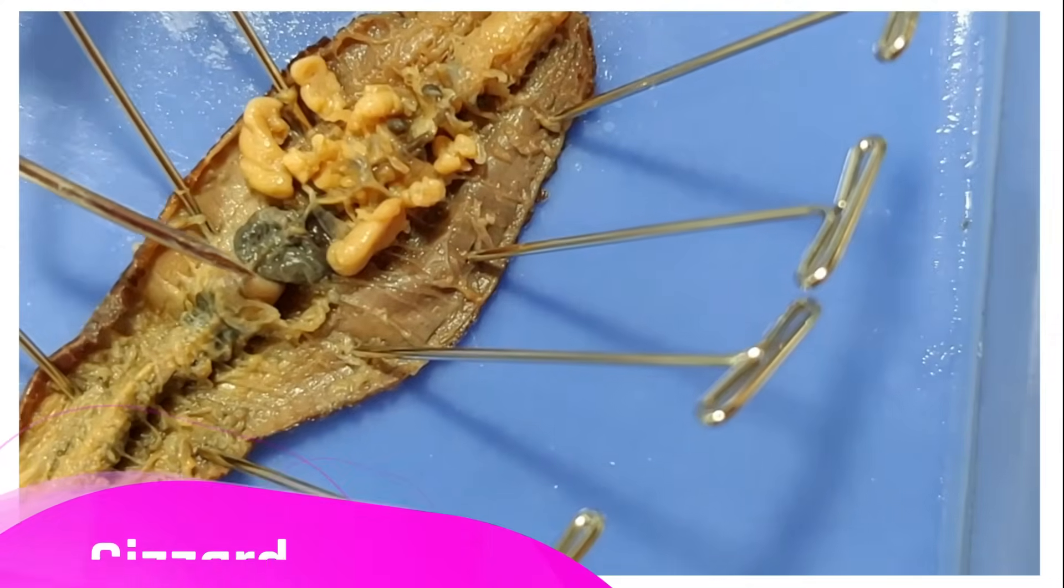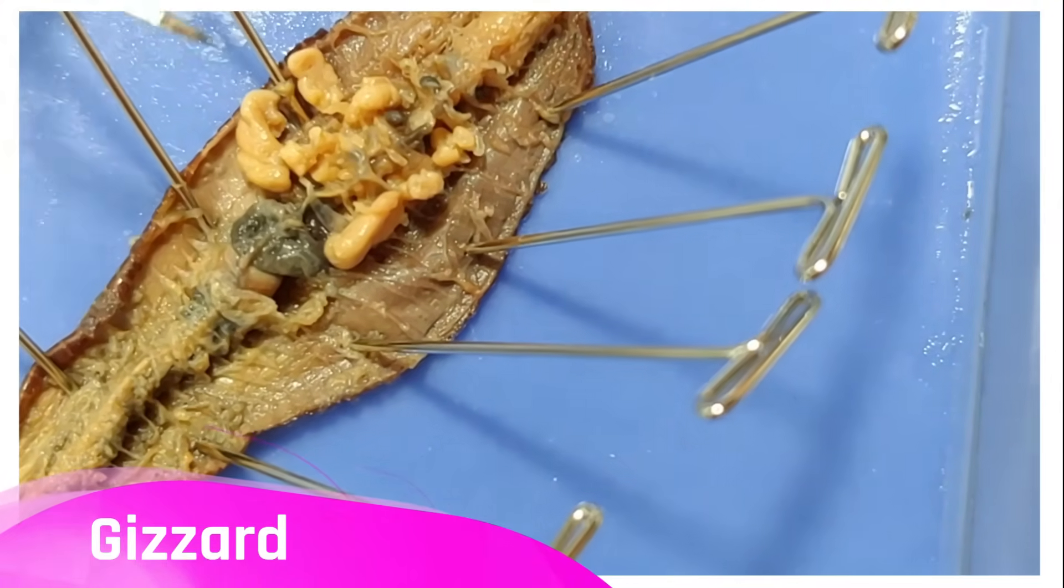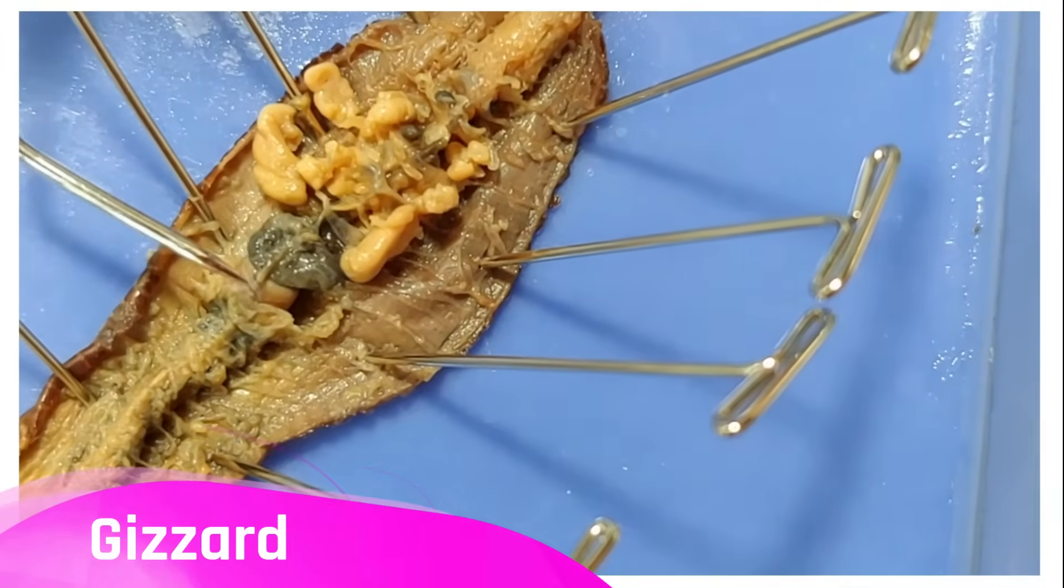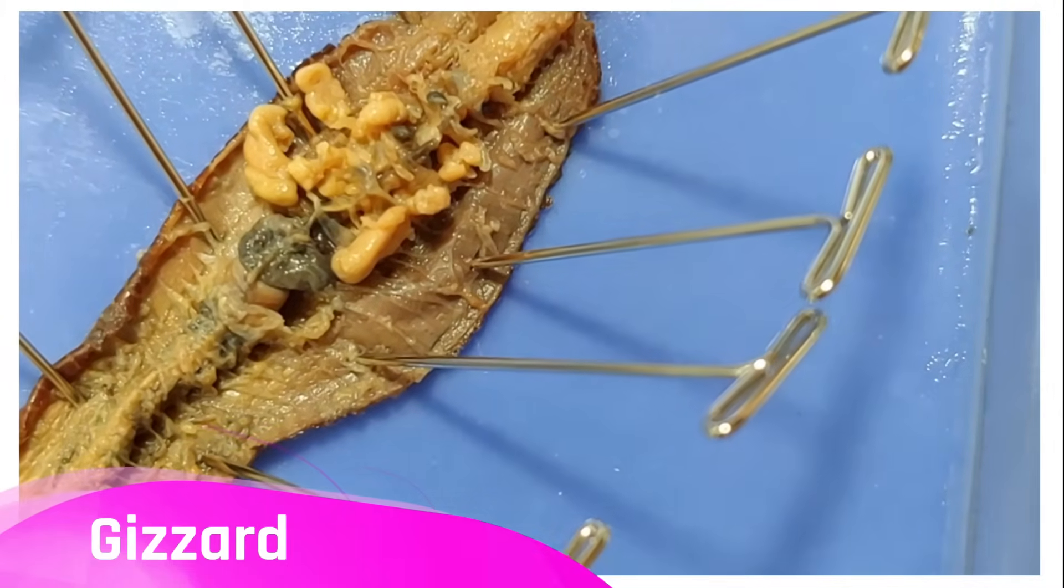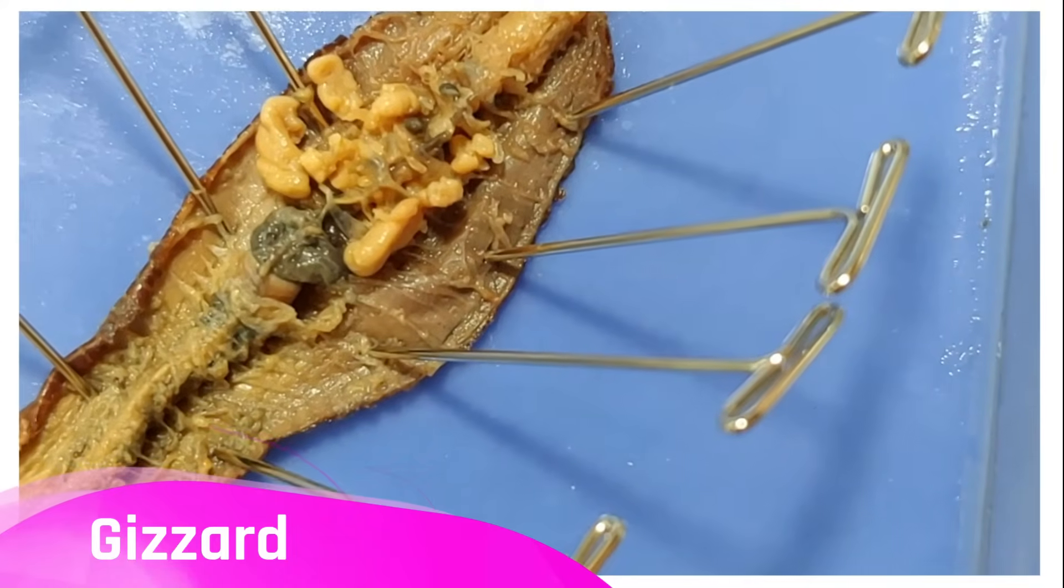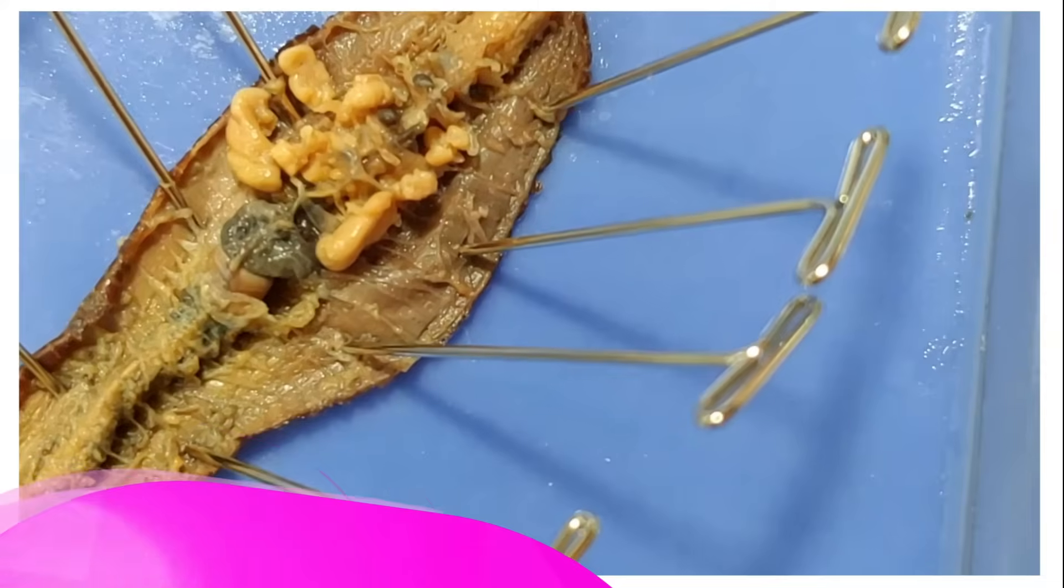Next up is the gizzard. When I poke the gizzard, it barely moves. The gizzard has a thicker muscle lining than the crop because it does all the heavy lifting. It carries the entire digestive system on its metaphorical shoulders. The gizzard functions in mechanical digestion by contracting and grinding up the food inside it.